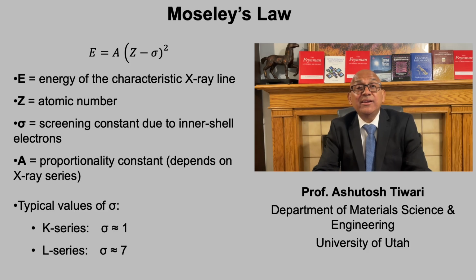As atomic number increases, the spacing between energy levels changes in a regular way, leading to a predictable shift in characteristic X-ray energies. Because of this, each element produces X-rays at unique energies, which is why EDX can be used to identify elements based solely on peak position.